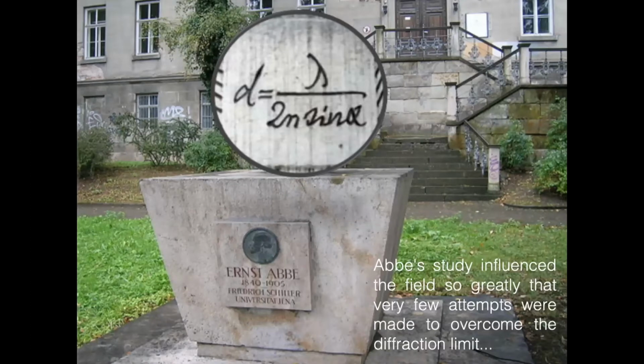Ernst Abbe actually has the equation for the diffraction limit etched on his memorial. The problem was that because he was such an influential person, and Lord Rayleigh, of course, was not a stupid person either, people were not brave enough to go past this resolution. They thought, okay, these are the laws of nature, you cannot beat physics. So they didn't really try to overcome this diffraction limit until not so long ago.